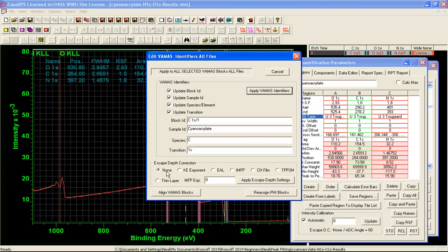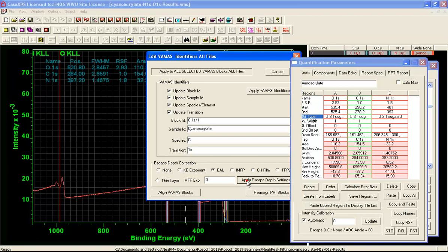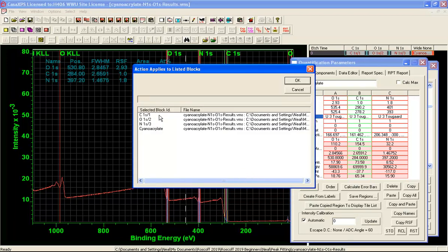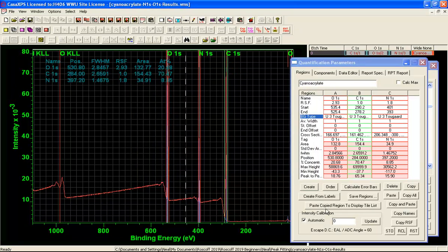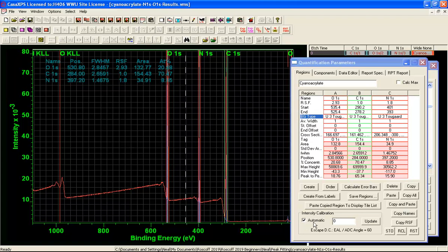So that is where it says none. We will change that to effective attenuation length and then we will apply that to these VAMAS blocks that were selected here in the right hand side. So now we have an effective attenuation length correction and the result is an atomic concentration calculation based on a transmission function that is a National Physical Laboratory relative transmission function.